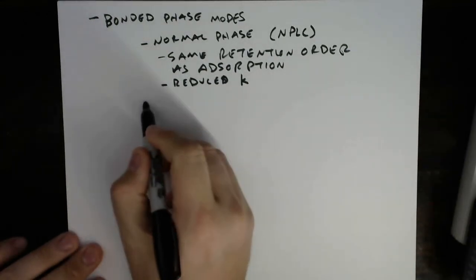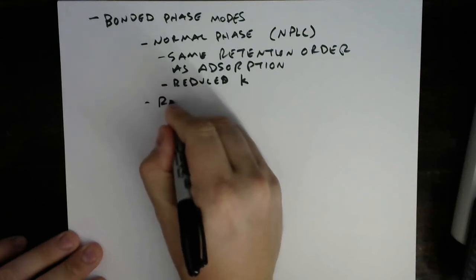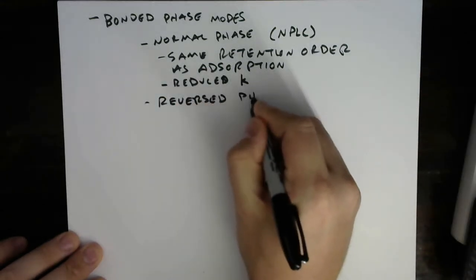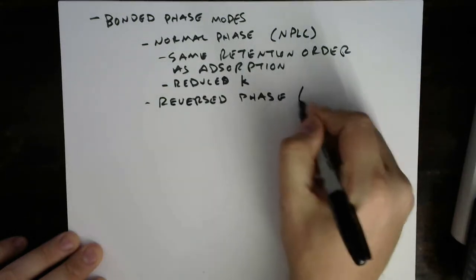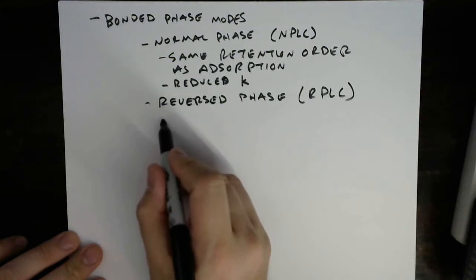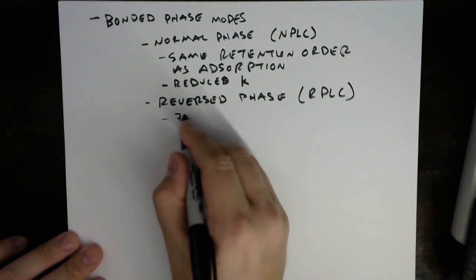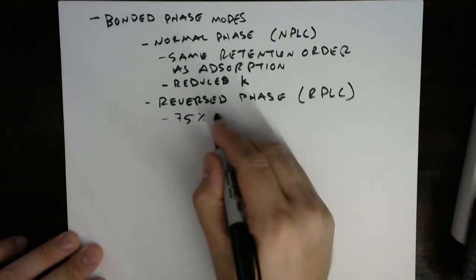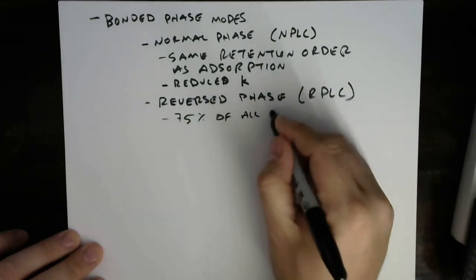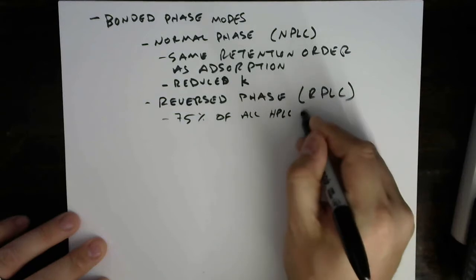Okay, the second was reversed phase, or RPLC. This is the big one, guys. This one is maybe 75% of all HPLC applications.